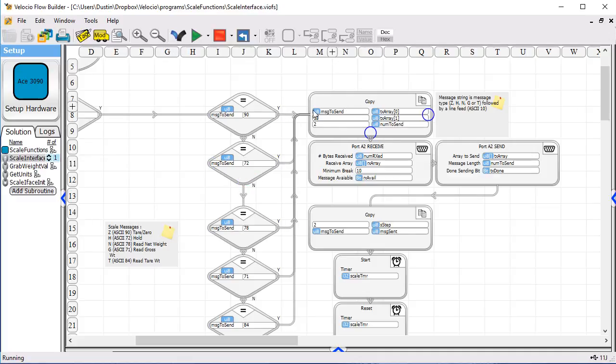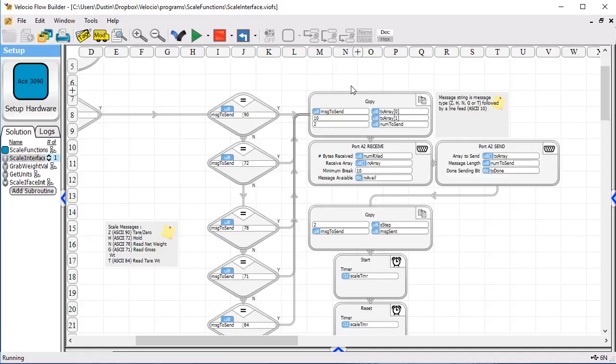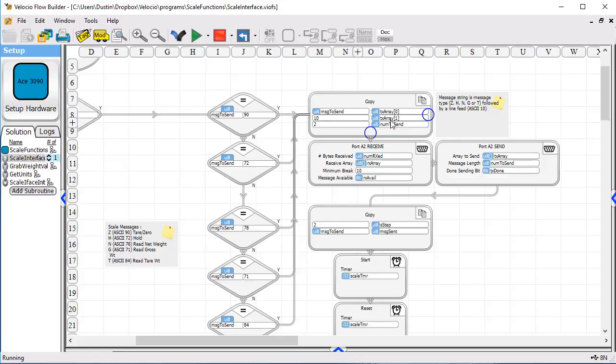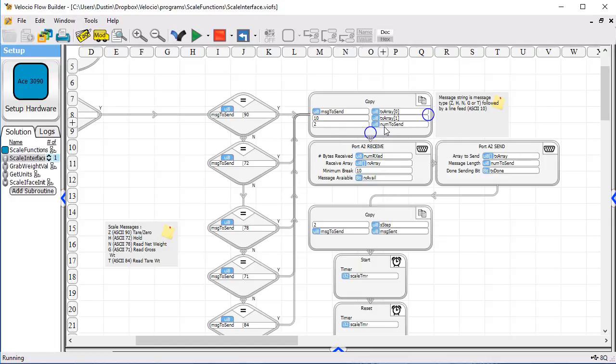then we go over and we copy our message into a transmit array. This one happens to only be two characters long. So we copy the character, whatever it is, like if it's a zero, we copy the 90 into the transmit array index zero, and we copy a 10, which is a line feed, into array position one, and we set it up for two characters to send.